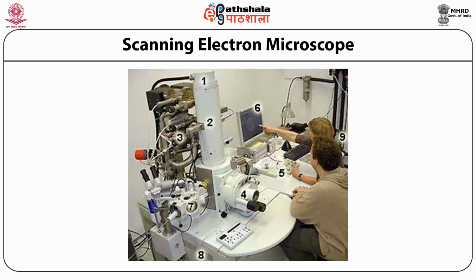5. Operational panel with focus, alignment and magnification tools and a joystick for positioning of the sample. 6 is the screen for menu and image display. 7 is the cryo unit to prepare, break, coat and sublimate frozen material before insertion in the observation chamber in cryo SEM mode. 8 is the electronics stored in cupboards under the desk.